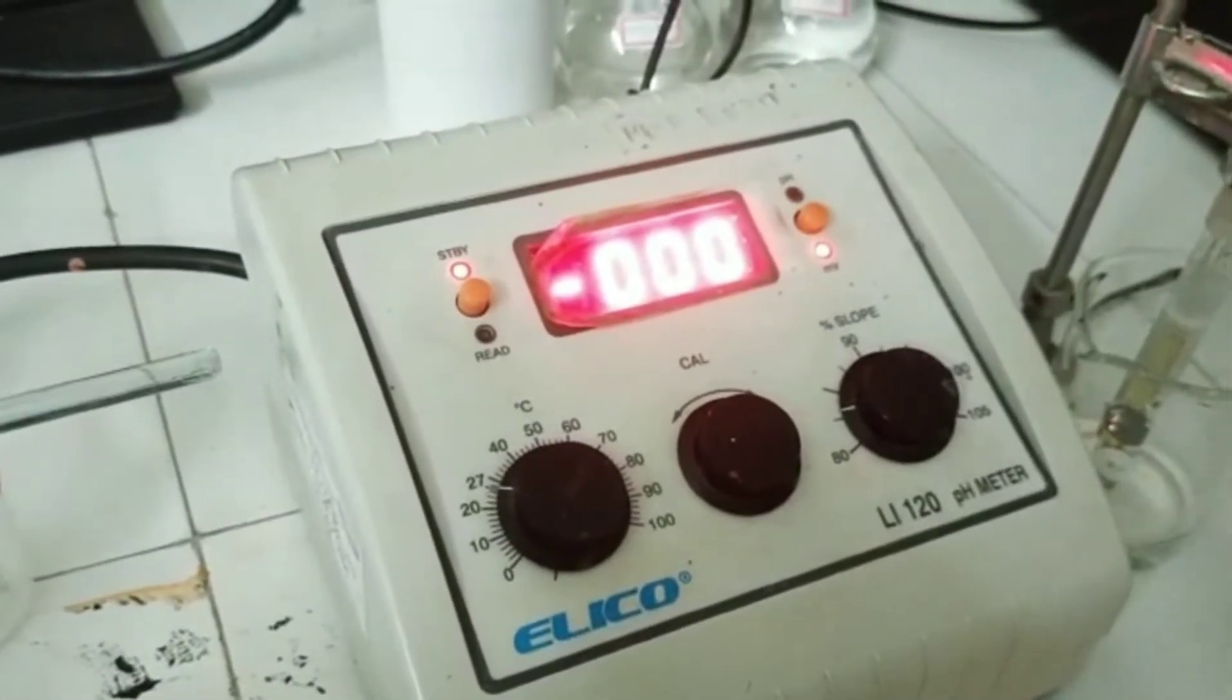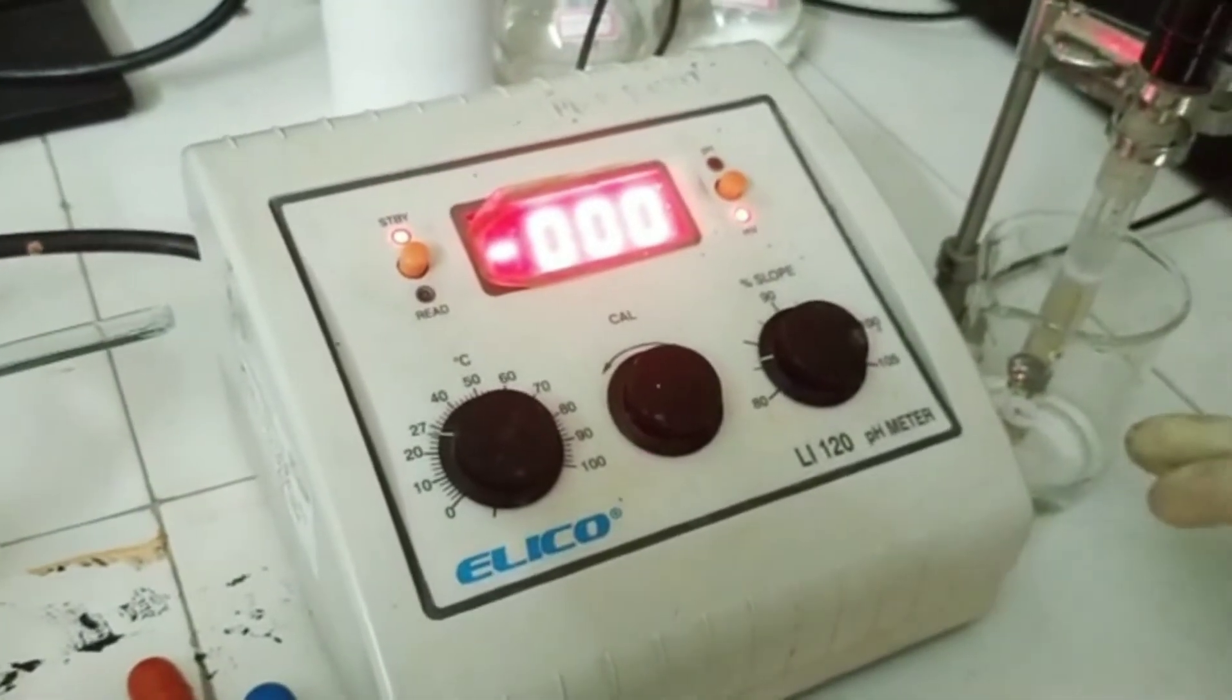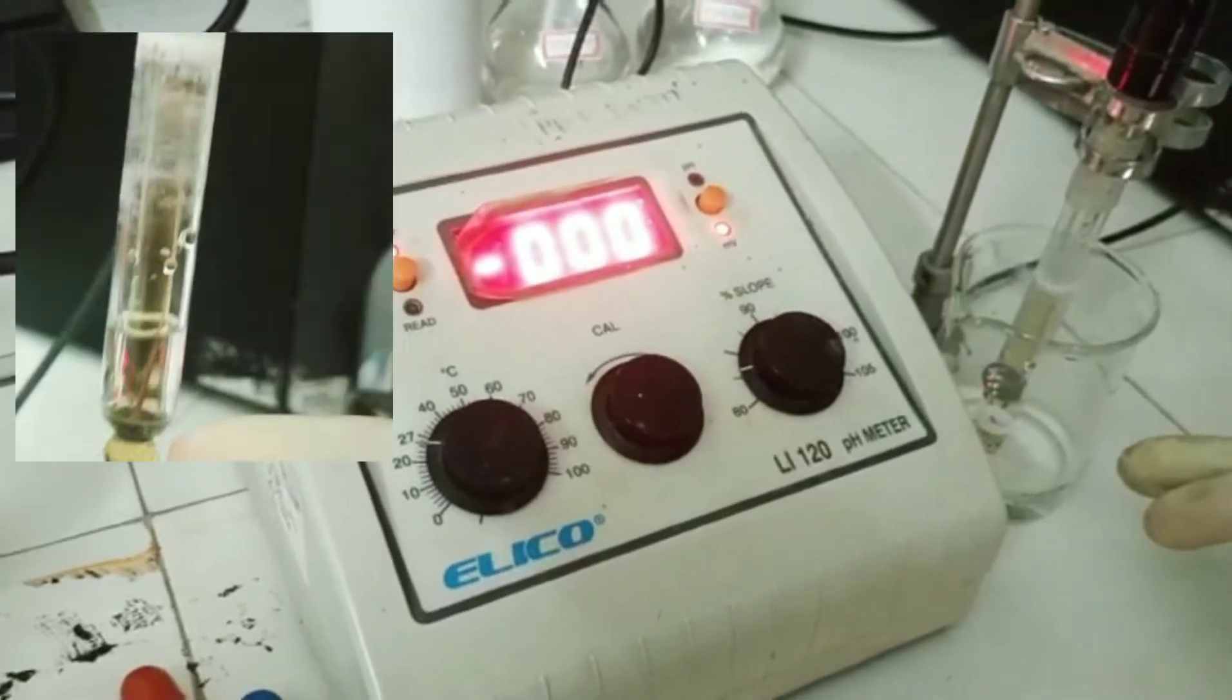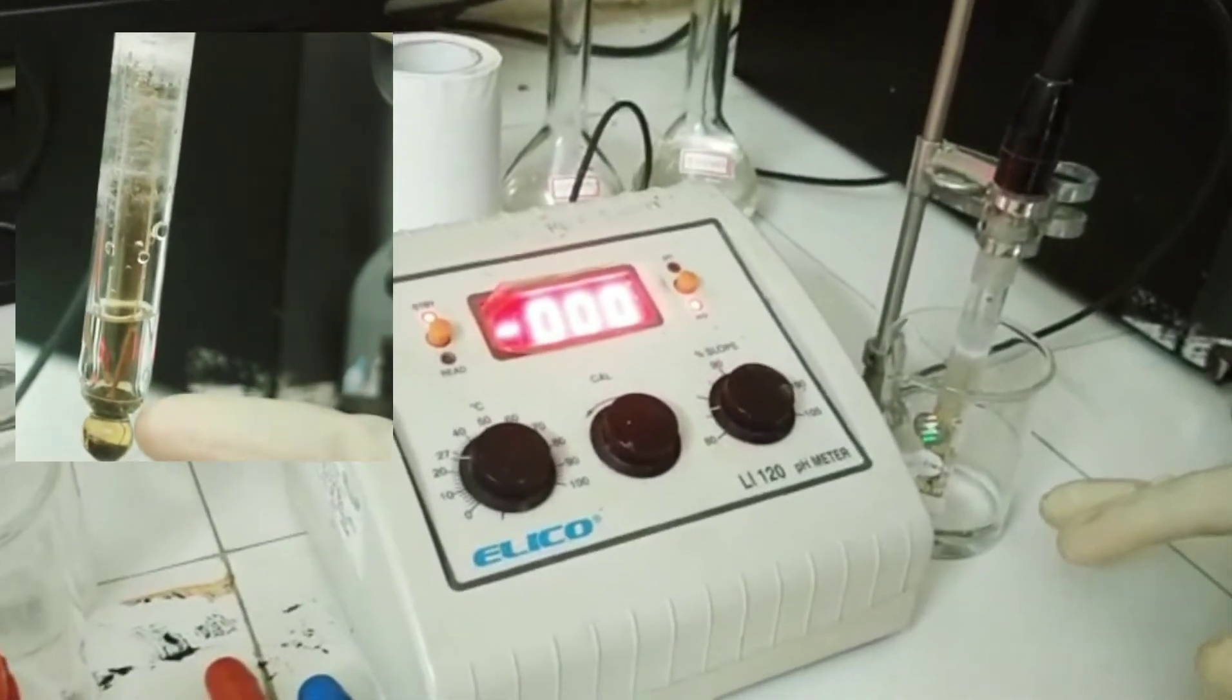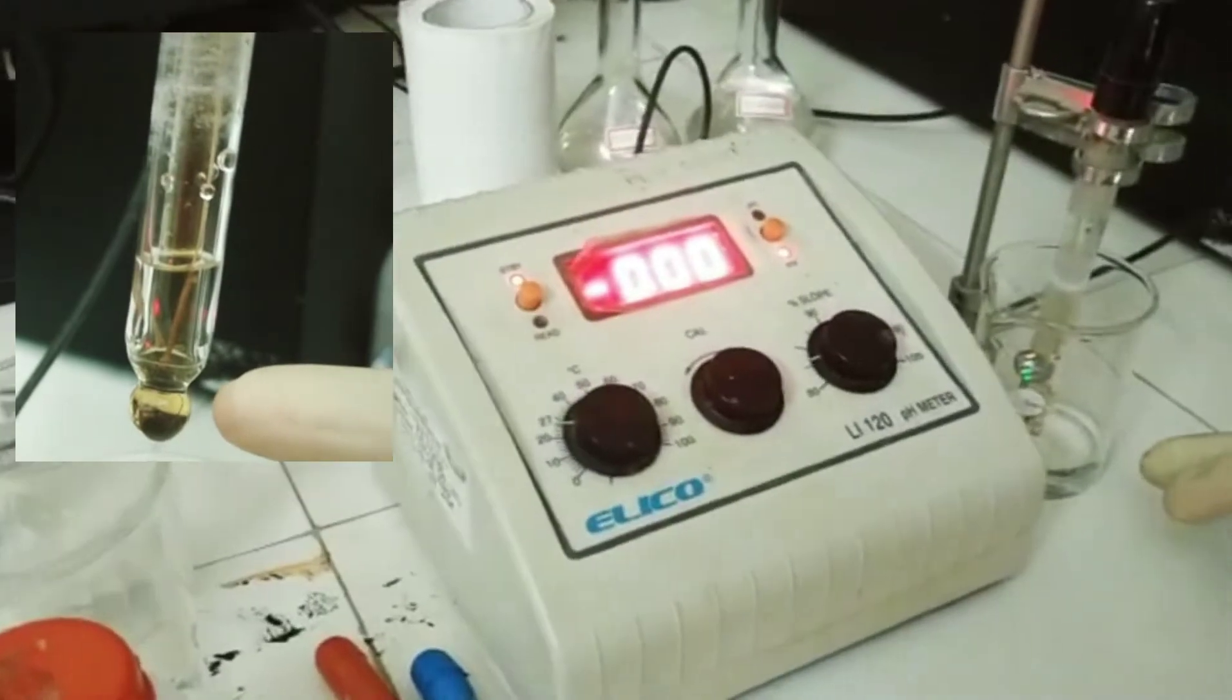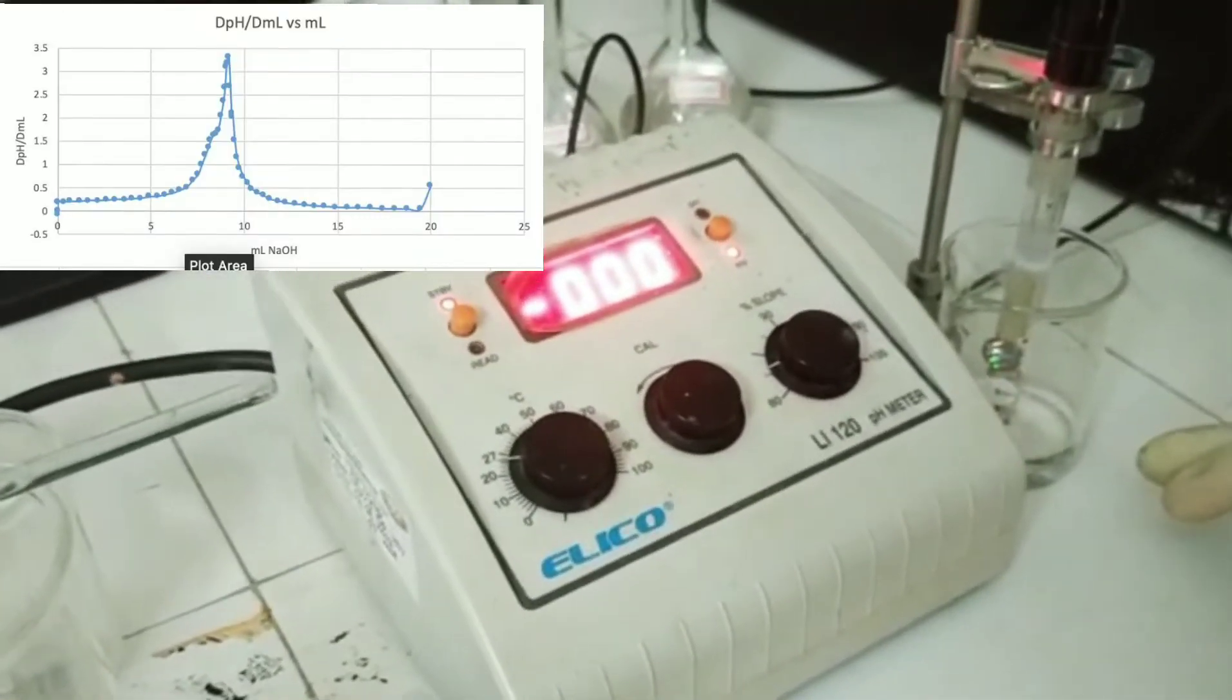Potentiometric titration is based on the fact that the potential across the two electrodes, that is the indicator electrode and the reference electrode, will be changing sharply at the end point. And this end point can be determined by constructing a graph taking potential on y-axis and volume of the titrant on x-axis.